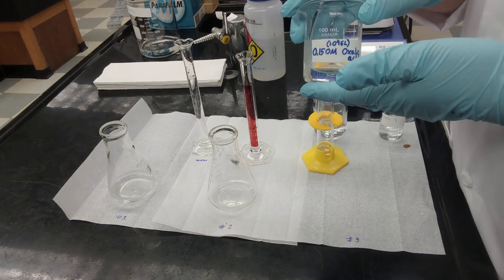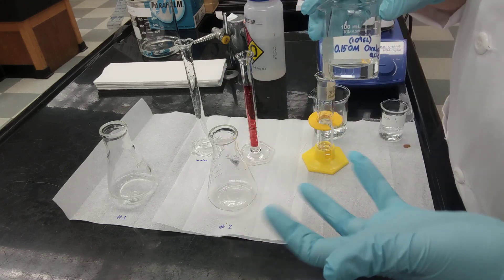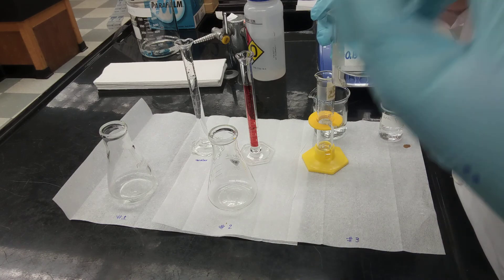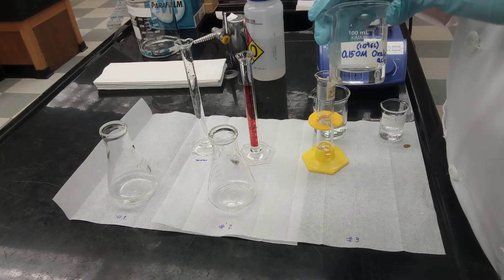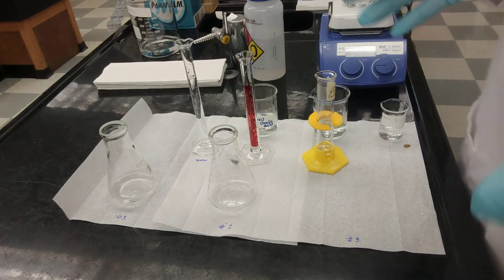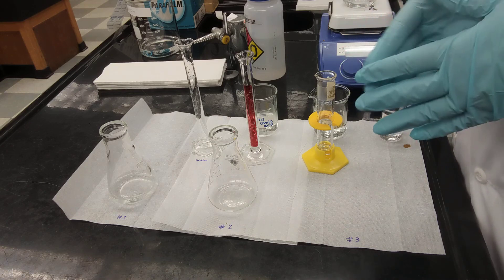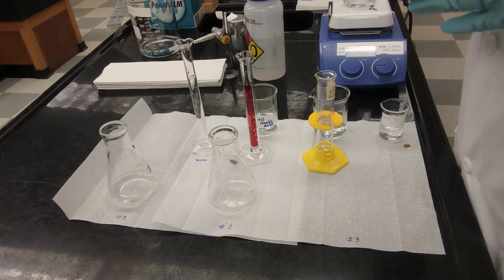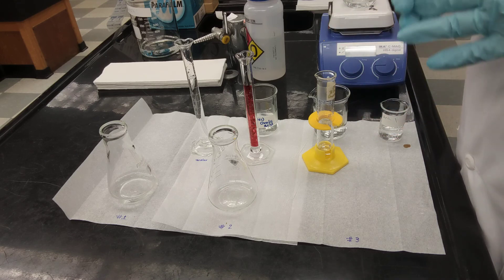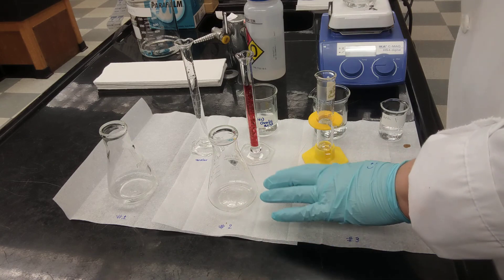Since we know the concentration of oxalic acid, we can calculate how many moles of oxalic acid we have in each sample. Based on that number of moles, we can calculate the number of moles of potassium permanganate and use that to get the exact concentration of the dilution we prepared. We're preparing three samples in exactly the same way. Each sample needs 10 milliliters of distilled water, 4 milliliters of oxalic acid with known concentration, and 4 milliliters of sulfuric acid at 3 molar concentration.